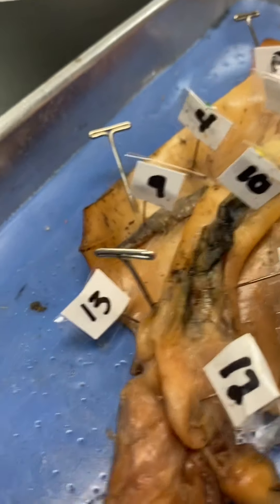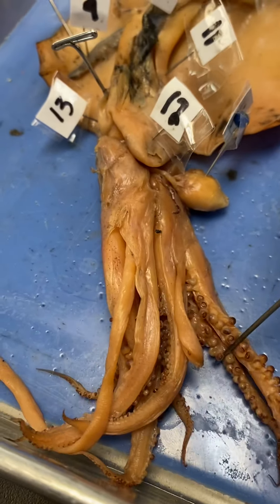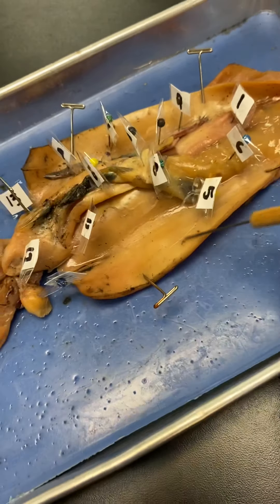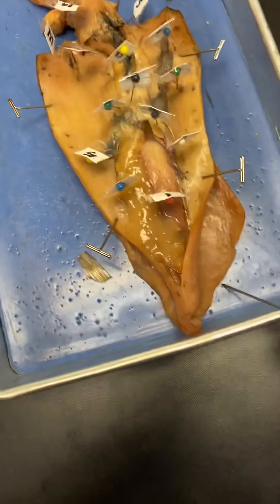Then I cut in between the arms into the head cavity. This is the buccal mass — it has the beak and mouth inside of it, so it's actually really hard. The beak and mouth are inside the buccal mass, and then it has a tube attached to it — that's the esophagus. It passes behind the brain and then goes all the way up to the stomach.